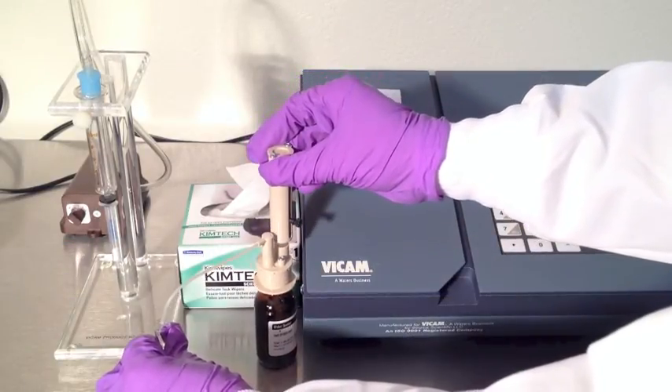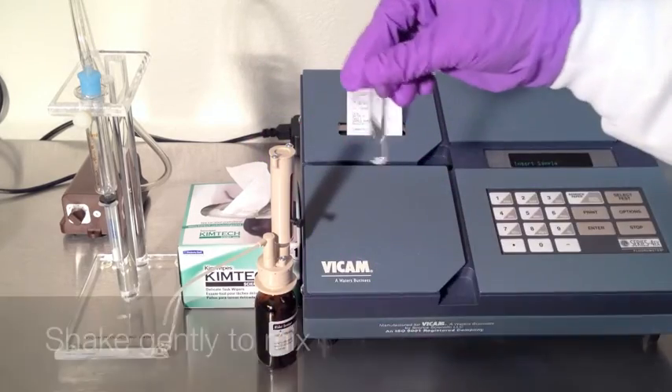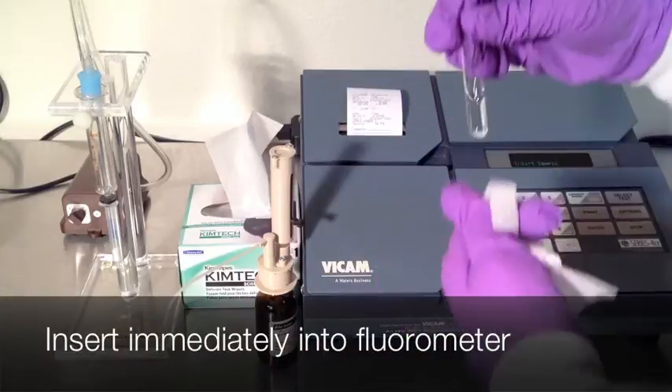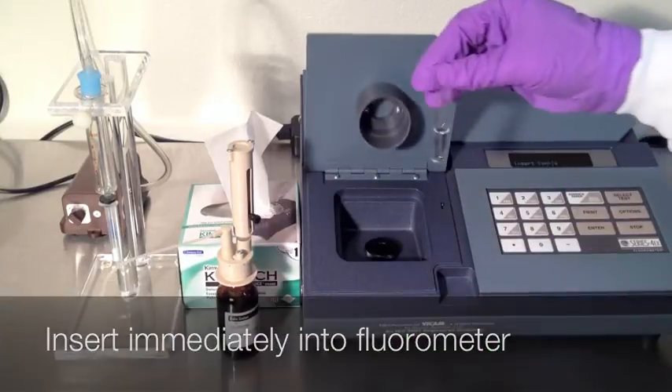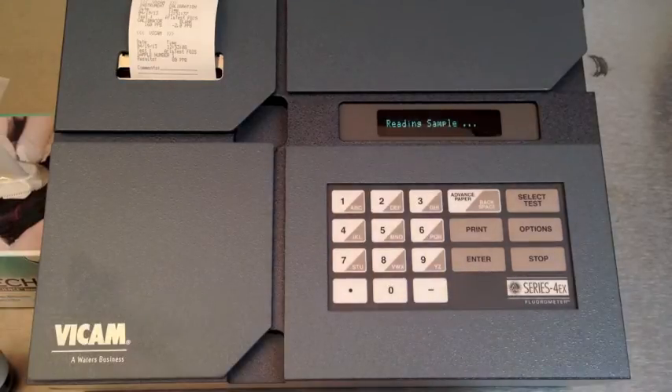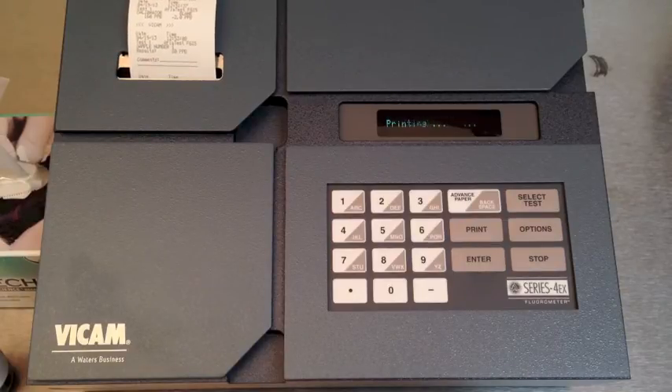Add one milliliter of Aflitest developer. Shake the cuvette gently to mix, then wipe the cuvette and place it immediately in the fluorometer. You'll have results in 60 seconds. The printer will produce a time-date stamped receipt of your test. You can also retrieve a record of the results through the USB port to a Windows-based computer.